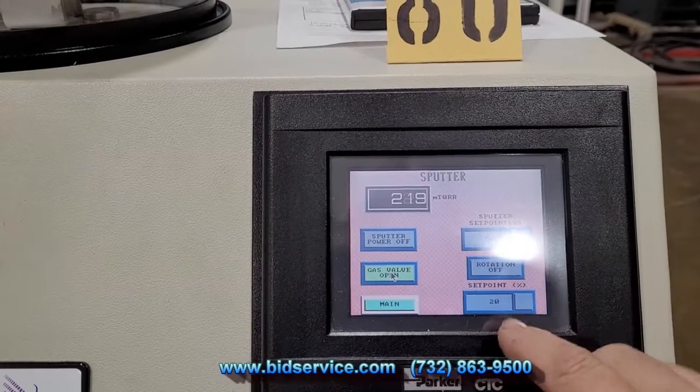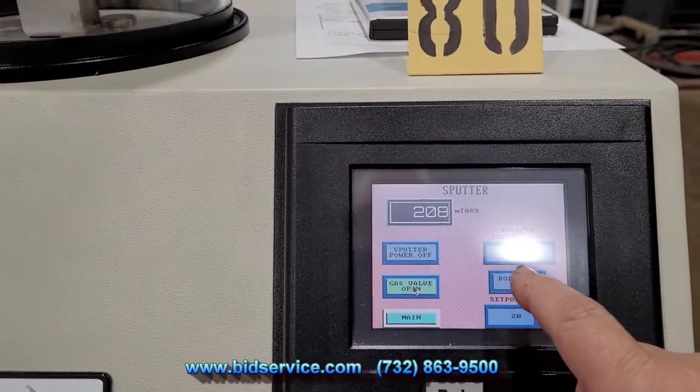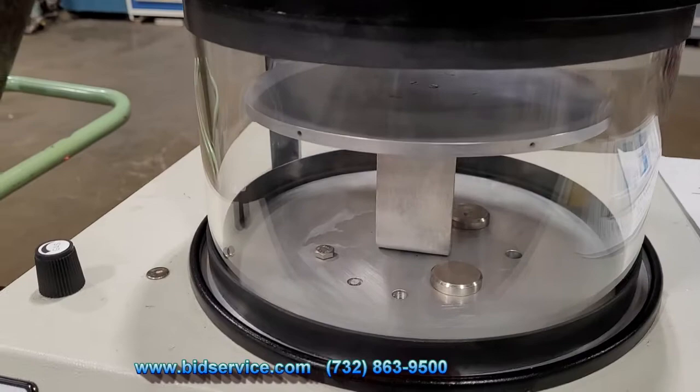I have the power on 50%, and if I want to rotate the table, I'm going to turn that on, and you can see the table rotate.